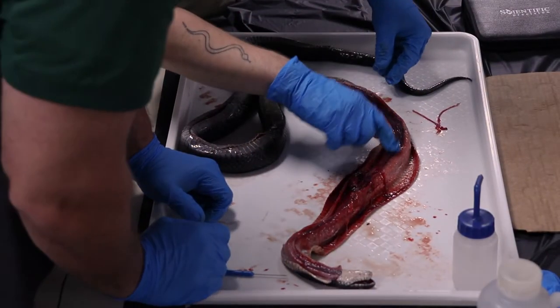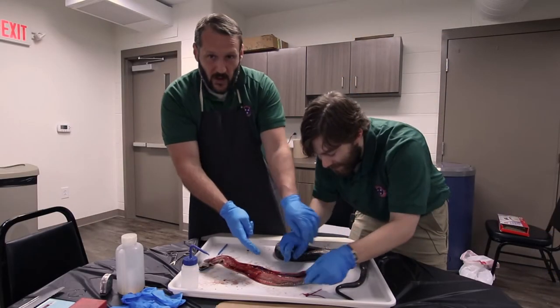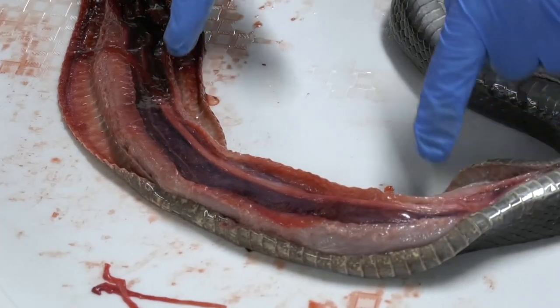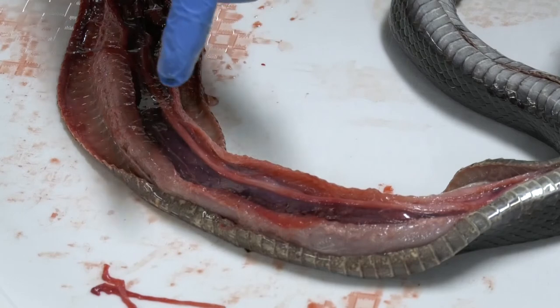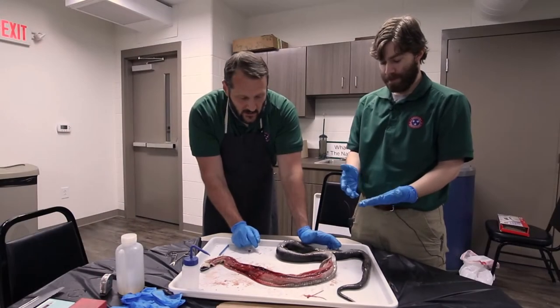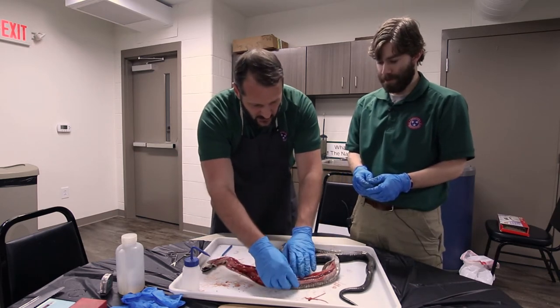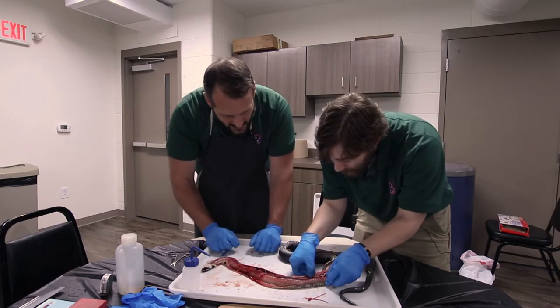So we do have the liver here, just a big, long, dark organ. It doesn't look like much here, but it's there. You really get a sense of how the liver is one of the largest organs in any vertebrate body, and the same is true for the snake. The liver does for the snake the same things it does for us. It converts the snake's metabolic waste, the waste that the cells generate from their activities, into less toxic compounds. In snakes, that becomes uric acid. Our liver converts our toxic cell waste into a different chemical called urea. But it also helps in the metabolism of fats, because the liver produces bile, which is delivered to the stomach and is a digestive aid. This liver is incredibly long and makes up most of that body cavity, it looks like.